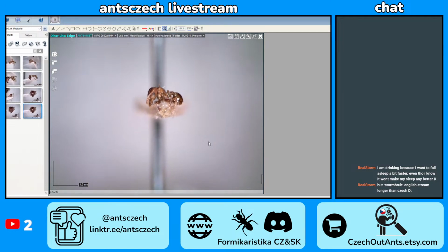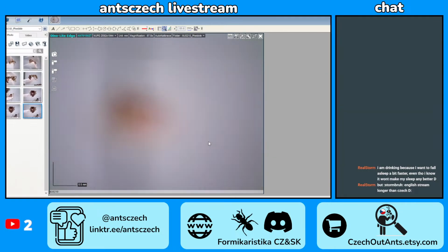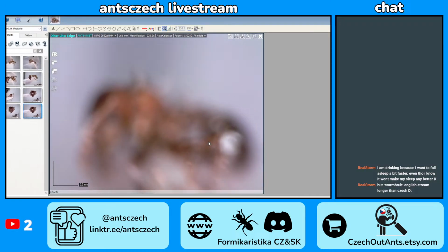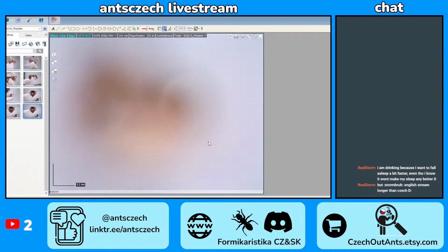Oh, that has some long spine. Okay, let me zoom. Maybe it looks like Fragilis or something. There's so many. But it would be the first for Solomon Islands. Is it for Solomon or is it Papua? Papua.